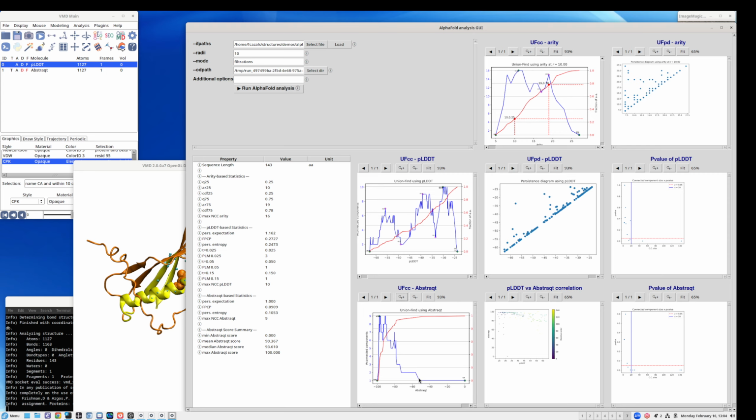And so here we have negated the scores too, and as you can see, we have excellent scores, almost 100, and poor scores in the 50s, meaning that in the structure we have a whole range of scores. Yet, as you can see, we have essentially one extended local maximum, instead of having 3 regions.